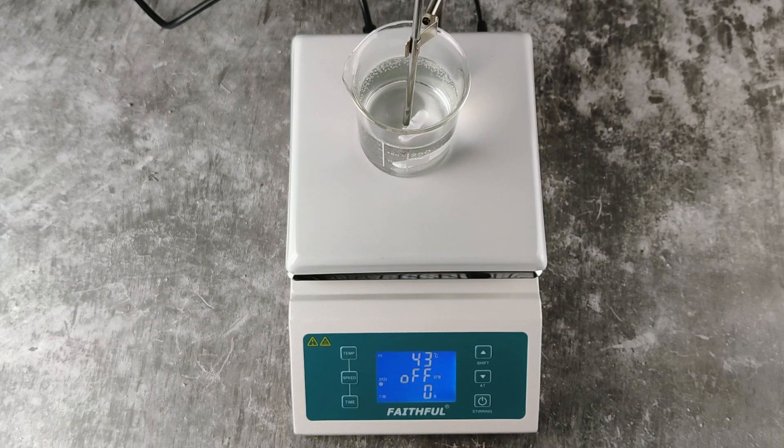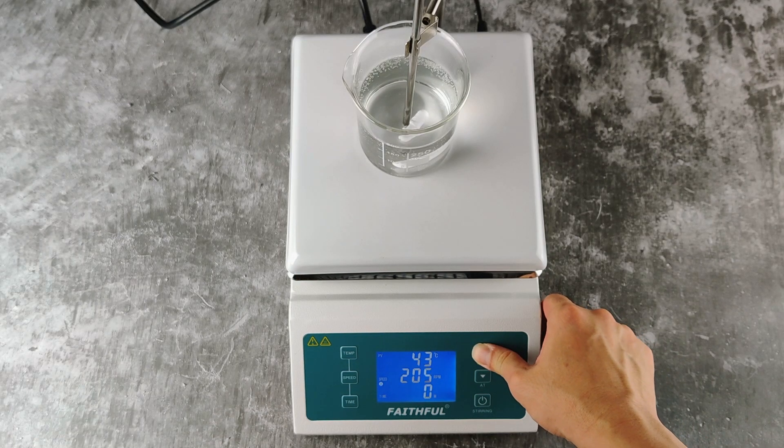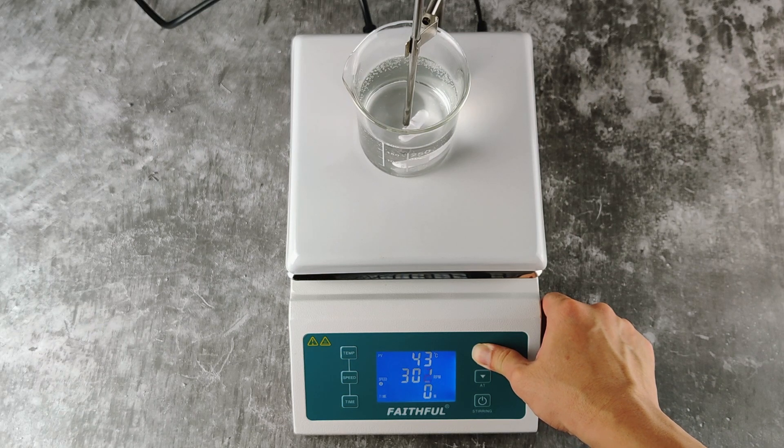How to set the stirring speed. Press the speed button. Using the up and down arrow keys, choose the speed that you desire. In this case, we will use 500 RPM.